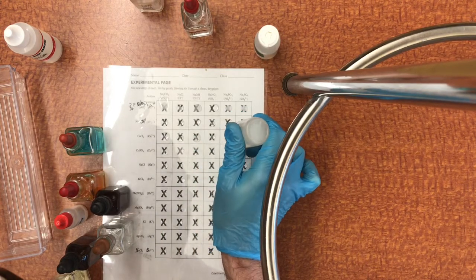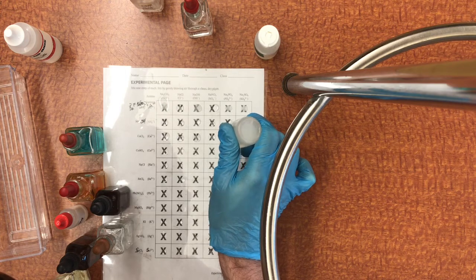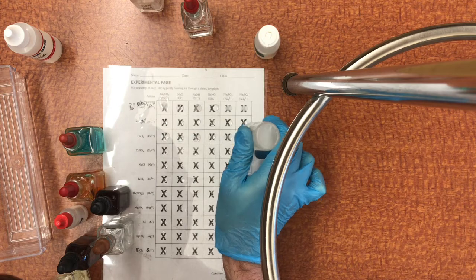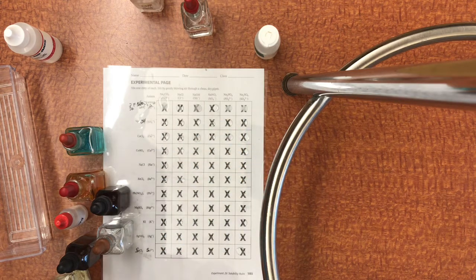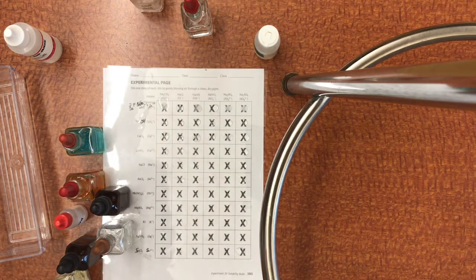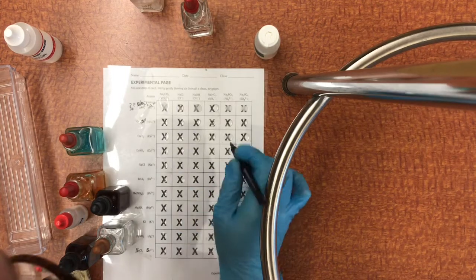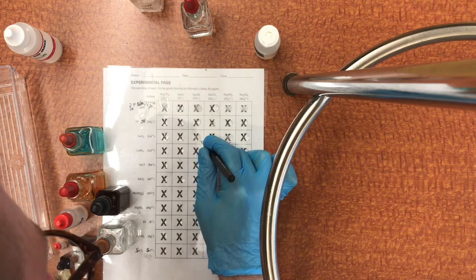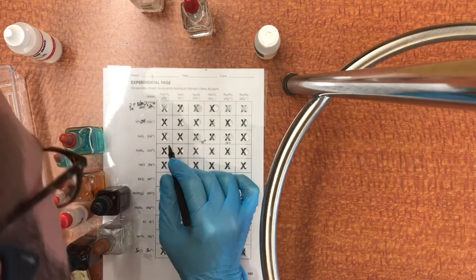Nitrate, no reaction. Phosphate, I do get a reaction with the phosphate. And the sulfate, not a clear reaction. So I would say that I'm only getting a reaction here. I'm going to try it. PPT, now that I'm close enough.